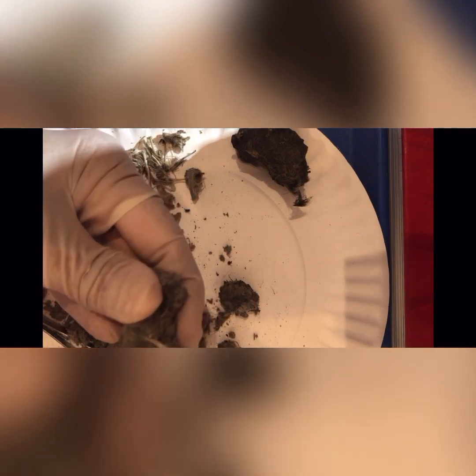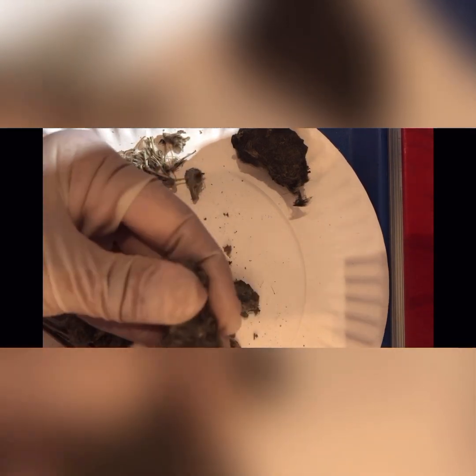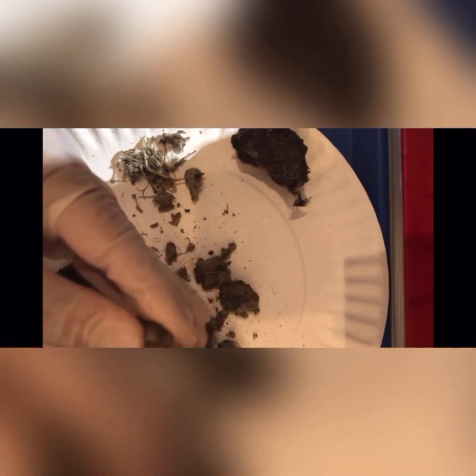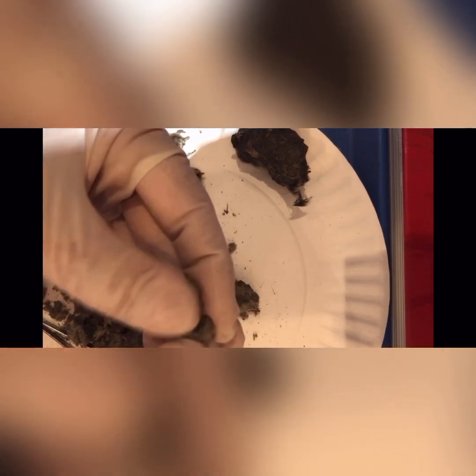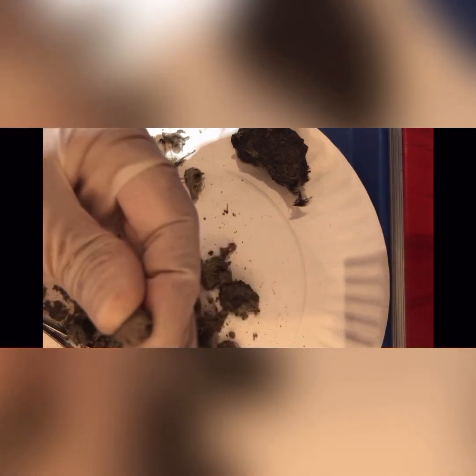Let's keep dissecting. Keep opening it up. Tiny, tiny bones, so many bones. There's just a whole lot in here. And it looks like another big bone.